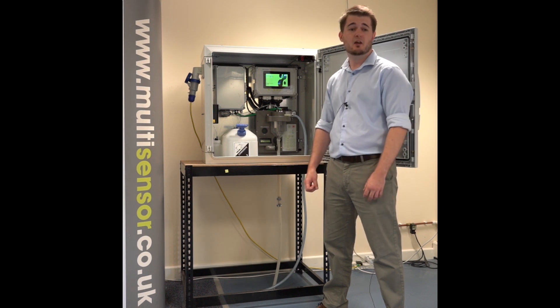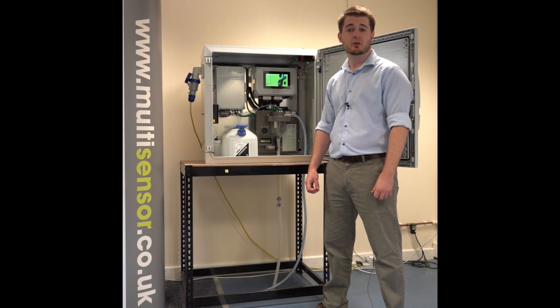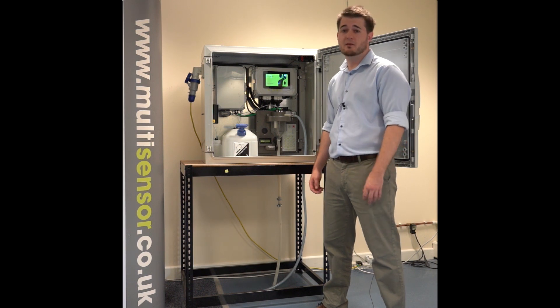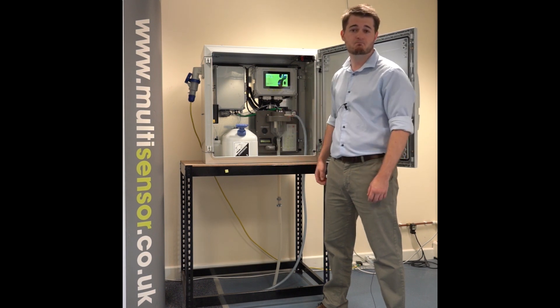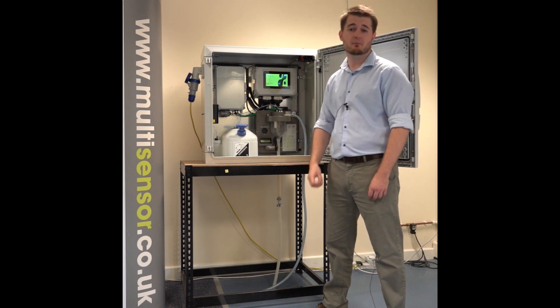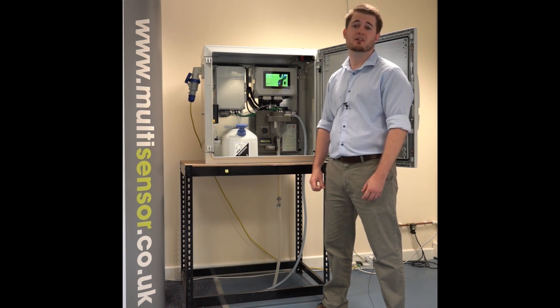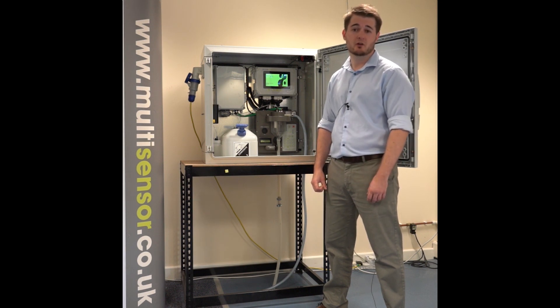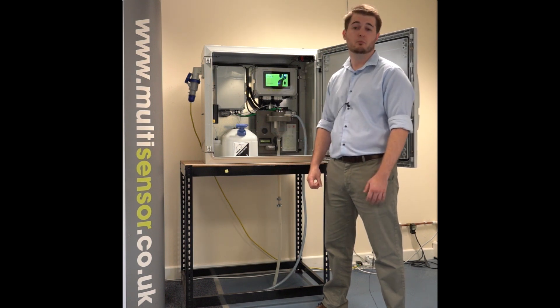This has the effect of converting almost all of the ammonium present in the solution into ammonia. An equilibrium is then formed between the ammonia in the water and the ammonia in the gas phase, or the headspace. Our instrument will then take a sample of the headspace and measure the ammonia concentration in the gas using the electronic nose, before calculating the ammonia concentration in the water using the onboard electronics.